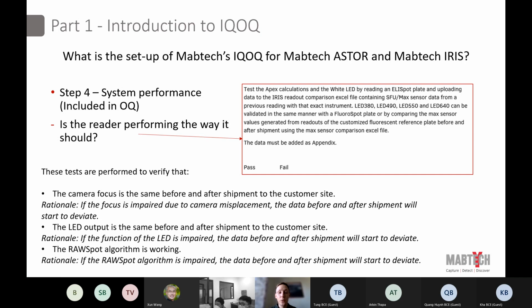As I mentioned, since everything is so new to you, we're going to help you out in the beginning, but the long-term goal is that you become independent in that data analysis process as well. We're going to start by assisting you, and after this we will also book service introduction meetings so that you get introduced to the service.